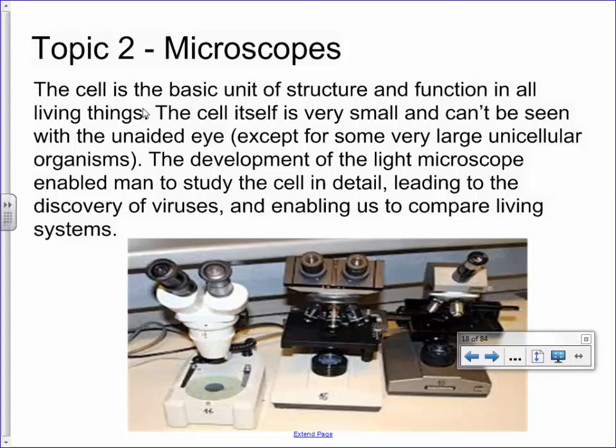And so on Monday, I'm gonna basically have you guys look at a piece of onion. And the reason I want you to look at a piece of onion is because we should hopefully be able to see different parts of cells of this onion. And then after you're done looking at an onion, I'll just give you a bunch of other random things to look at. You can just kind of explore and see what things look like on a microscopic level.